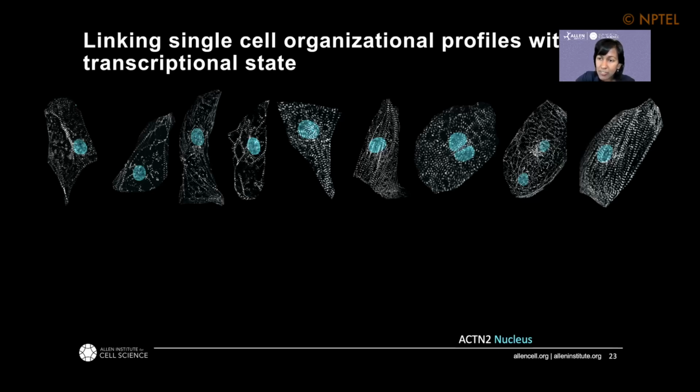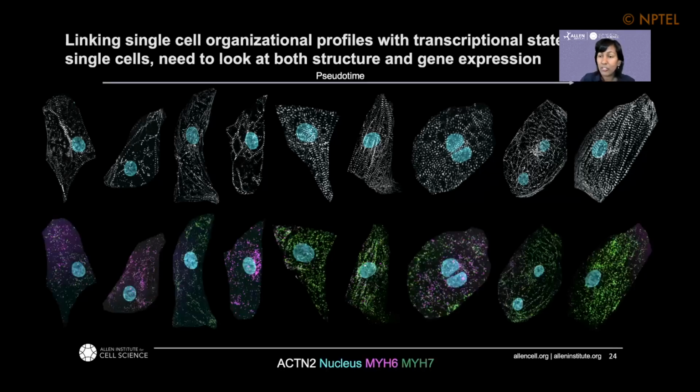And we did fluorescent in situ hybridization, or RNA FISH, to look for gene expression. So on the bottom panel here, there's the same cell as the one we imaged for the GFP. You can see pink is the younger gene and the green is the older gene.